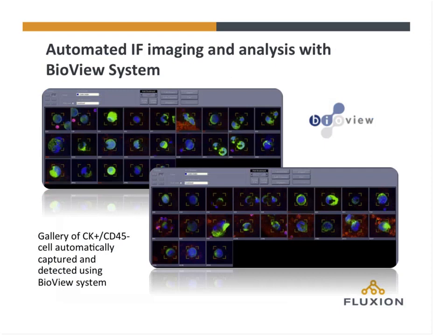The samples have the advantage, again, of being very low volume, so they can be spotted onto a slide without having to use a cytospin technique or any kind of complicated transfer mechanism. They simply can be dotted onto a slide, and it also takes up less area on the slide, and so that reduces both the processing time, the image analysis time, and the reagents needed to run these assays.